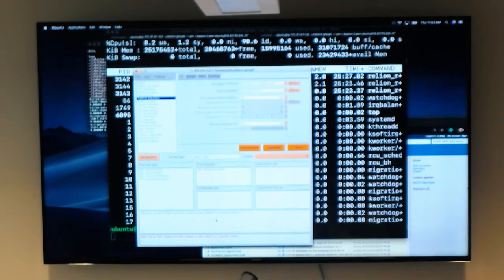As a rule of thumb, we do anywhere between 50 and 10,000 particles per class, because you might have a 1,000 particle data set or a 1,000,000 particle data set. It really depends on similarity. If you don't know, the number of classes is something that can be optimized, so you might end up running multiple times.